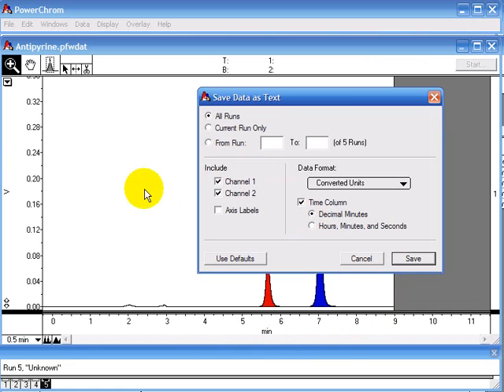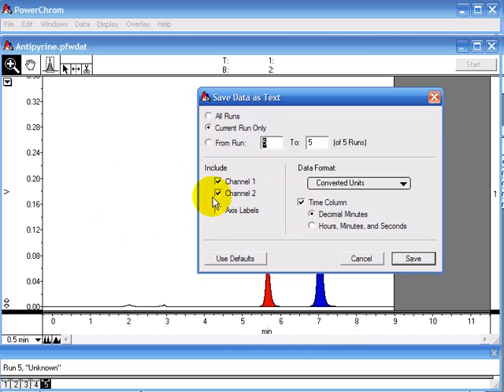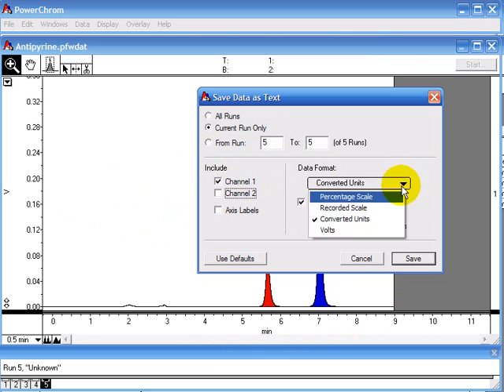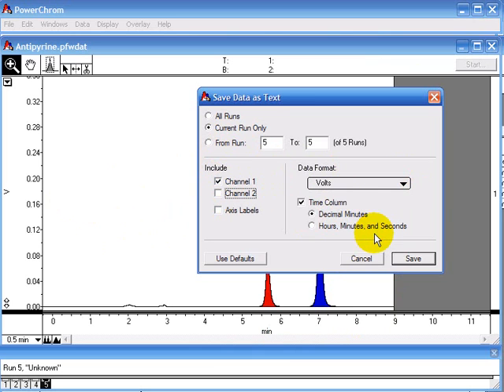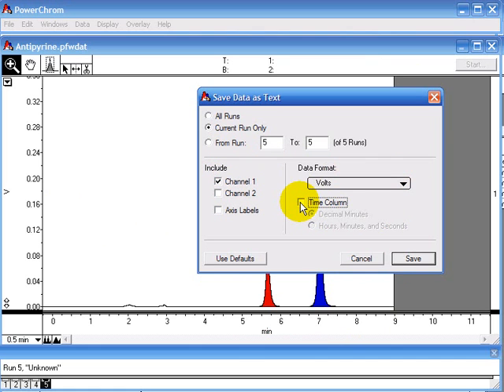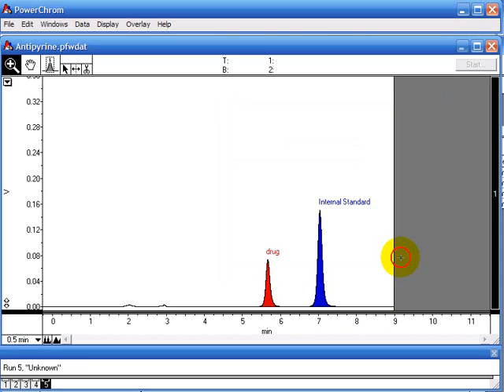I'm only going to save this run so I'm going to click current run only. I don't need to save the data in channel 2. The data format is in volts. I'm going to click on volts and I don't want to include the time column. I'm going to click Save here and that's saved.